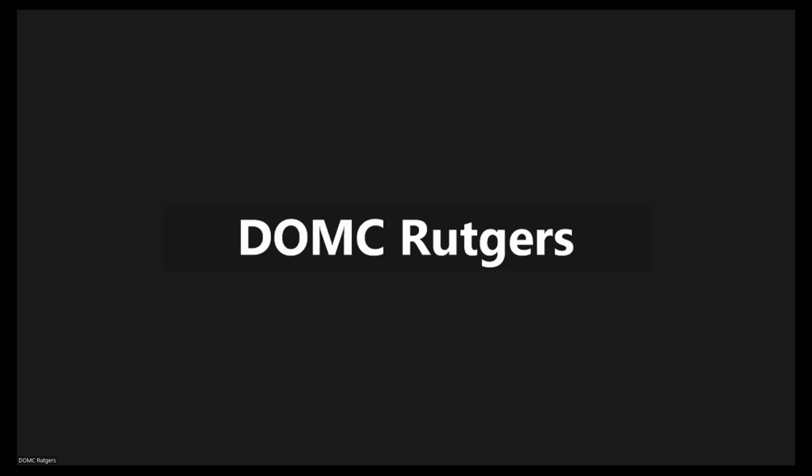In this video, we'll be going over the standard operating procedure for samples taken out for testing or shipping. This is a brief overview for the site. DOMC Data Manager will be sharing a pull list with the site that will look like this.